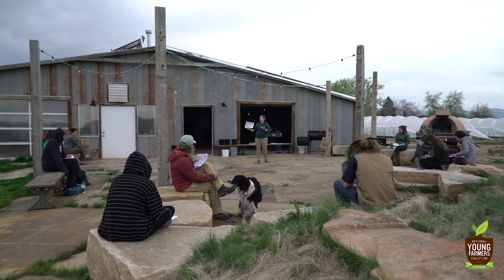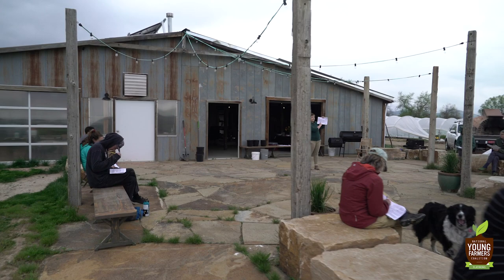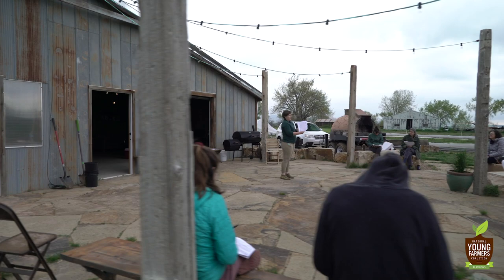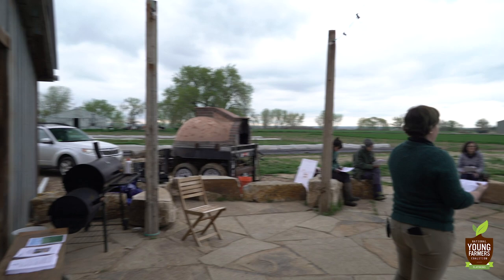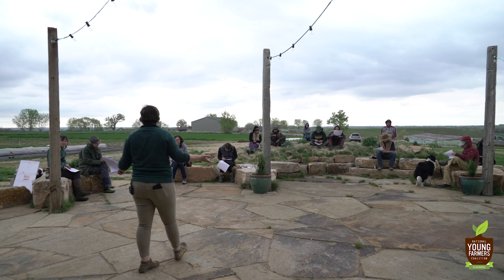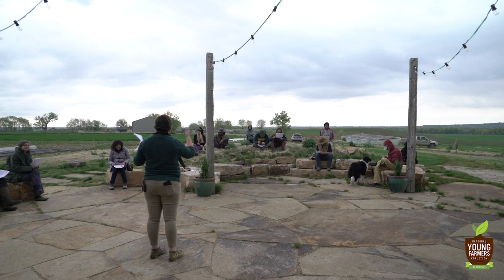So at the bottom, under the soil health section, right before the cover crop suggestions, where it says SHC, that is your soil health calculation. I forgot the last letter, that's why I wrote it down. Yep, it's your soil health calculation. That's on a scale of 1 to 50. The scale itself is based on a man named Haney, who developed the test. He developed the extraction methods, and he picked a scale of 1 to 50 as worst to best. Using the suite of tests that he performs, he puts that rating somewhere on the scale, and it's now widely used across the country.